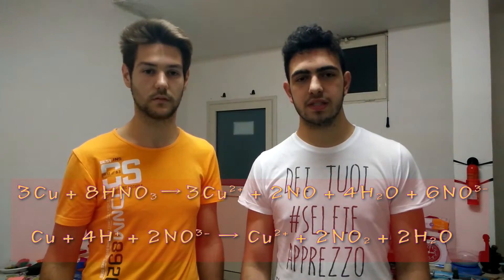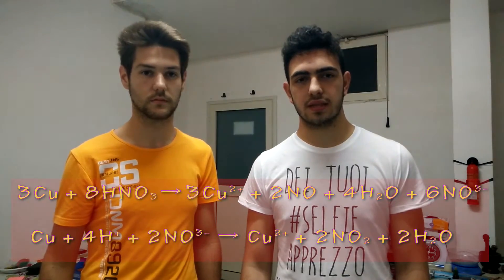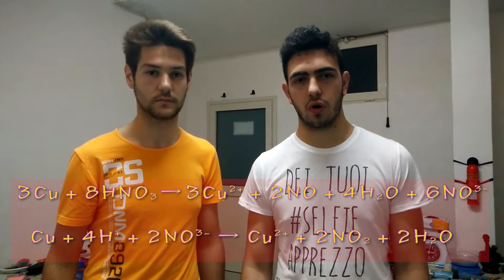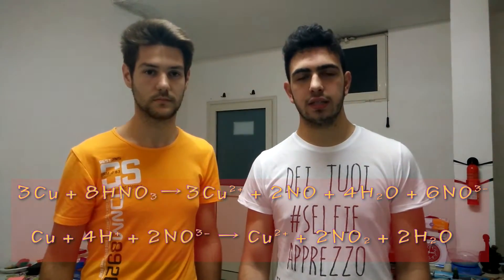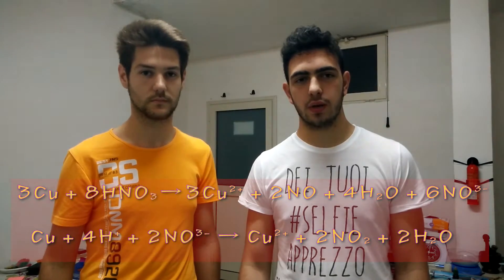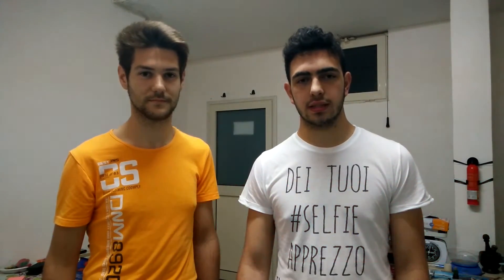First, the nitric acid does not react with copper due to a process called passivation, which happens when our nitric acid is too pure. We will add a little bit of water to lower the purity of the nitric acid and we will see the violent reaction that produces nitrogen dioxide.